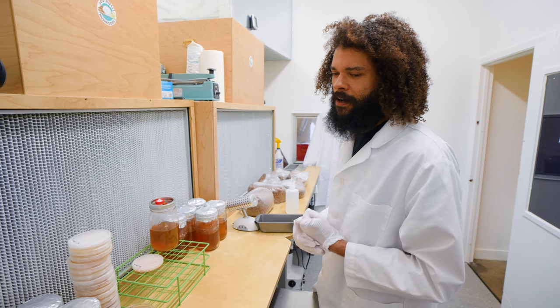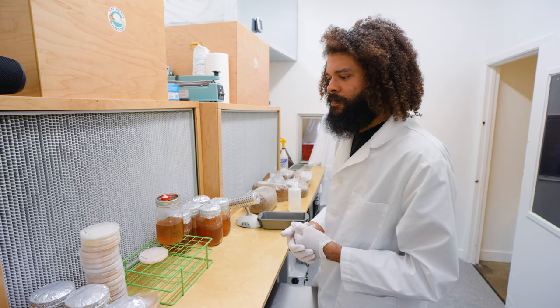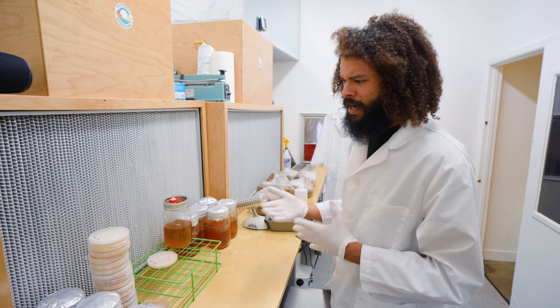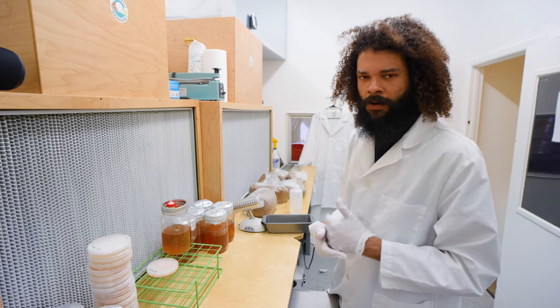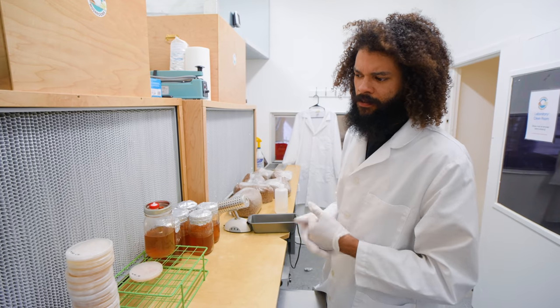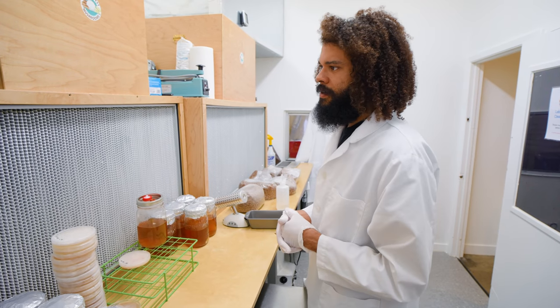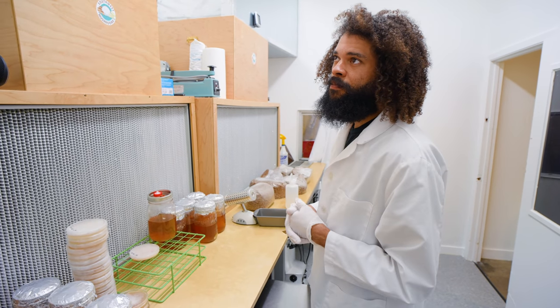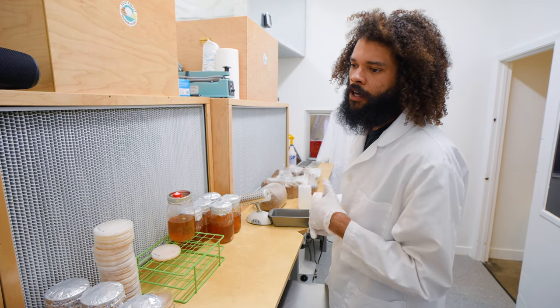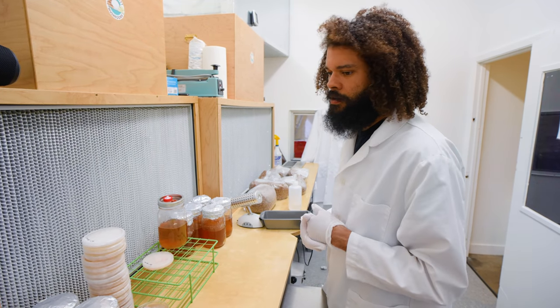The outside air also helps keep the temperature where I want it, because without air circulating in from outside the lab, the lab would heat up to well above 100 degrees, adding to cool-down times and delaying work. That's basically one of the reasons I went with two flow hoods bringing in outside air, because it gets pretty hot in here when we unload substrate — we usually have about 2,000 pounds of substrate cooling in here at a time.